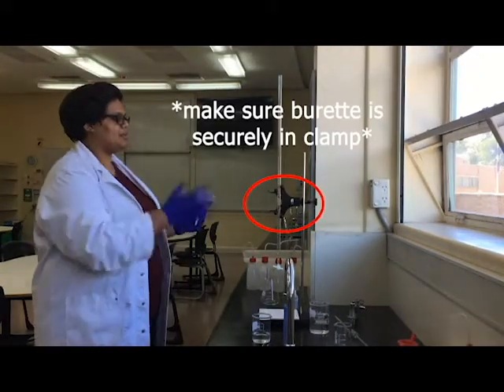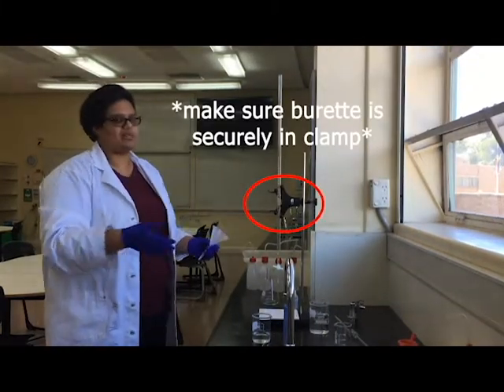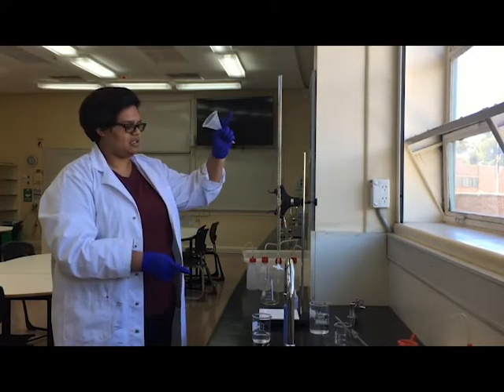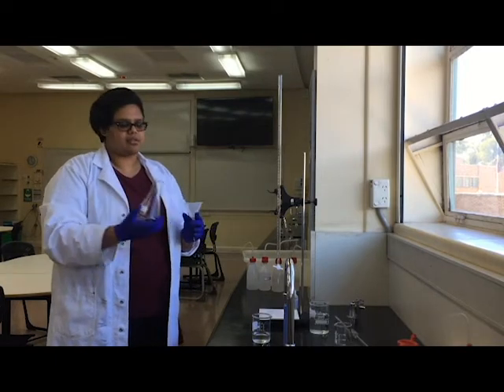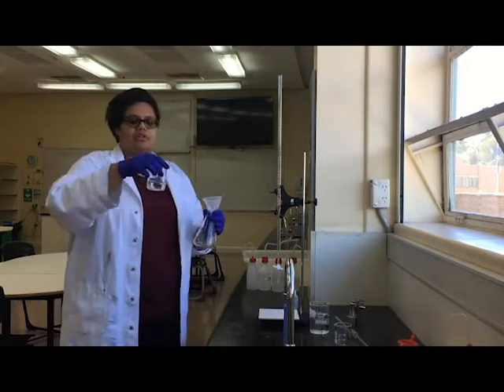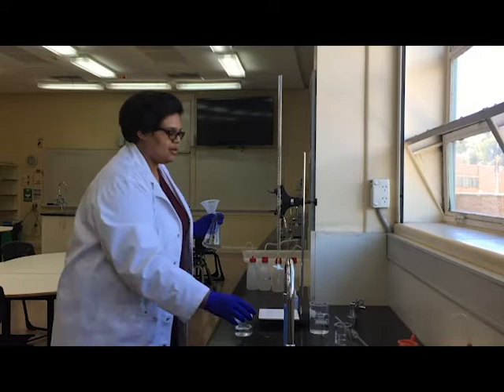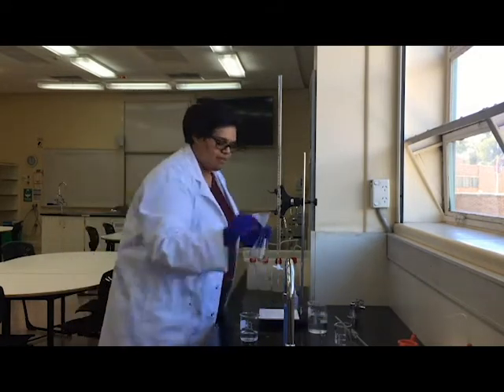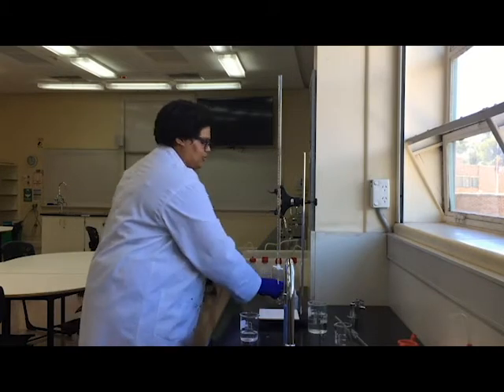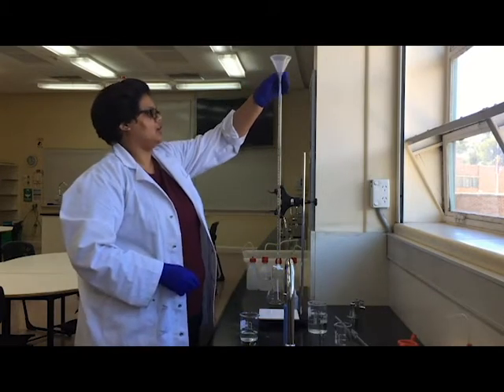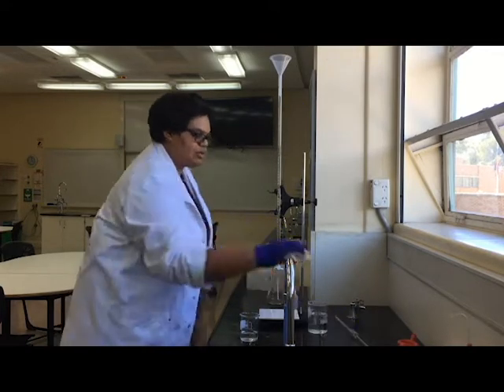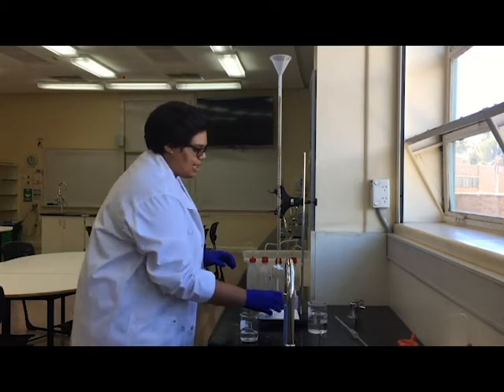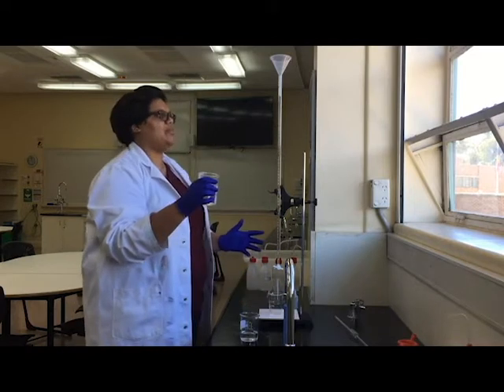Okay, so now we're going to fill up our burette with sodium hydroxide. It doesn't really matter if sodium hydroxide is in the burette or the conical flask, but it's better to put your unknown in the conical flask. Our unknown is going to be our hydrochloric acid because I am much more certain that this sodium hydroxide is 0.1 molar than I am of my hydrochloric acid. I'm going to put a funnel into the burette. I'm going to make sure that this is shut. I'm going to put a little waste beaker underneath just in case, and then I'm going to fill up my sodium hydroxide.